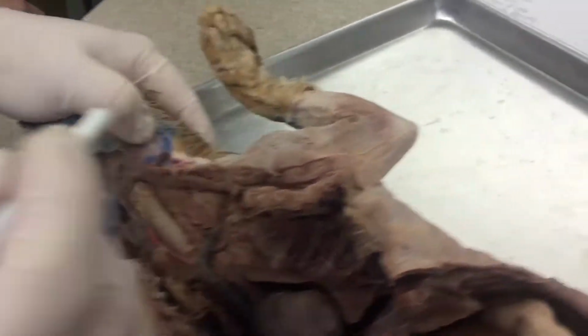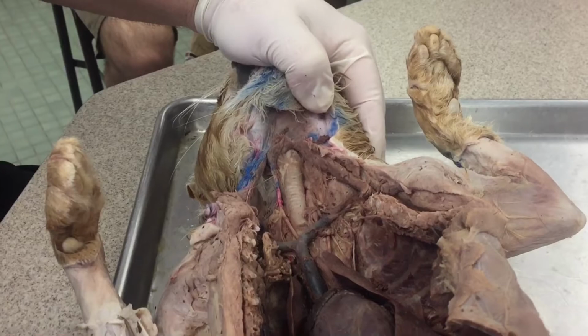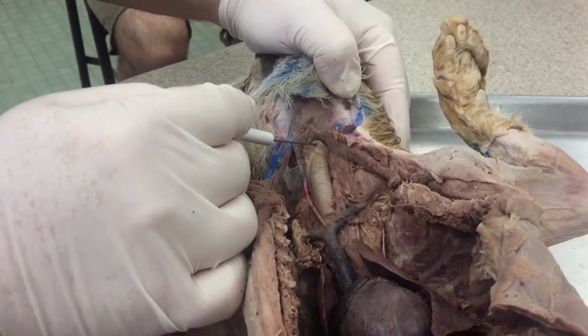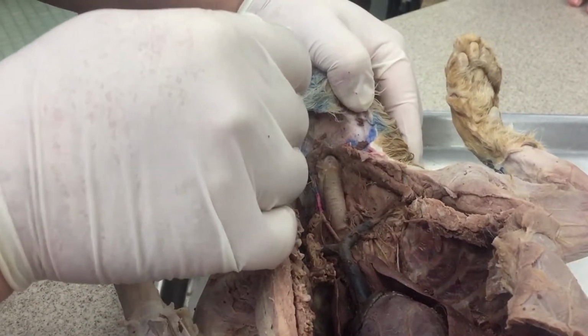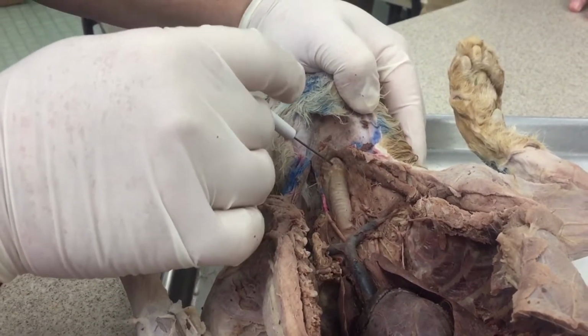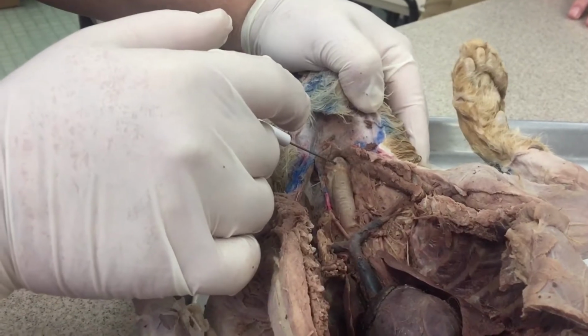All right, let's go through and take a look at the portions of the digestive and respiratory systems of the cat. Starting at the top here, the pin would be located right up at the top here. This hard portion, which actually looks a little bit different than this, is the larynx. In the larynx, one of the things I could ask is what are the three cartilages that make them up?